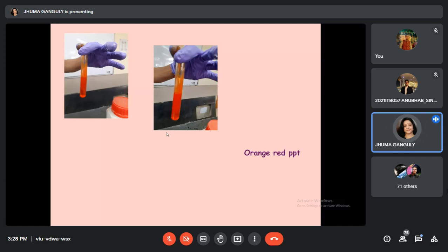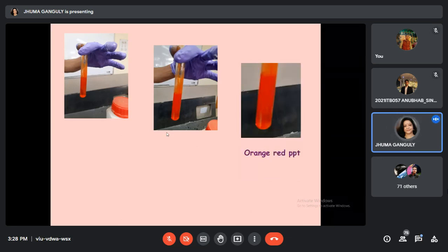So these are things I really miss. So I am taking part also. You can draw this way. Use this syringe to make this color. This is not harmful at all. So we are playing, not only the practical. We can play also in the laboratory in this way, in a safe manner. So this is the orange red precipitate. I mentioned it side by side for your enjoyment, just as if you are in the lab and can think what will happen. You see, the color is better than mehendi.